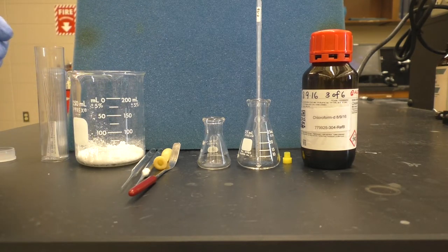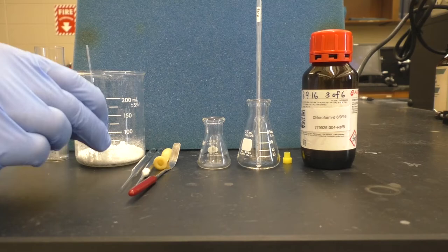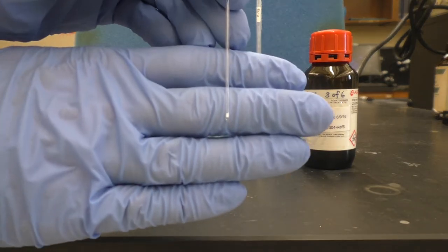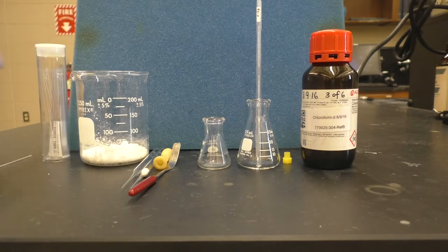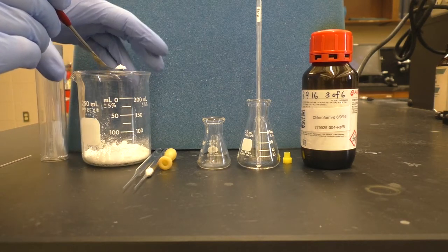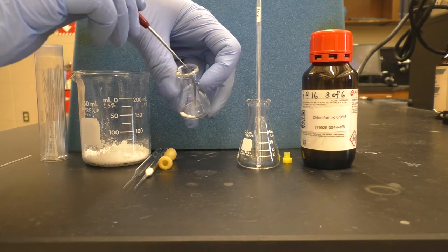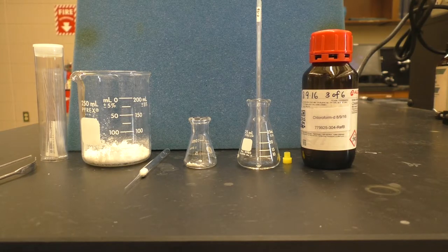Using the powdery material. That should be sufficient. And then to prep the NMR sample, I'll just take a small scoopful of material, place it in a clean Erlenmeyer flask, and then I'll dissolve that, or attempt to dissolve it, in approximately half a milliliter of deuterated chloroform, a common NMR solvent here.